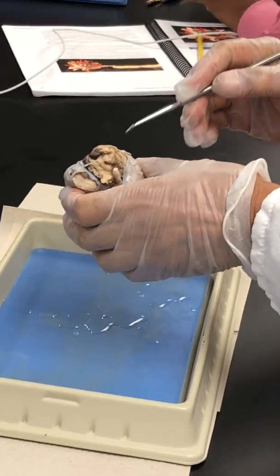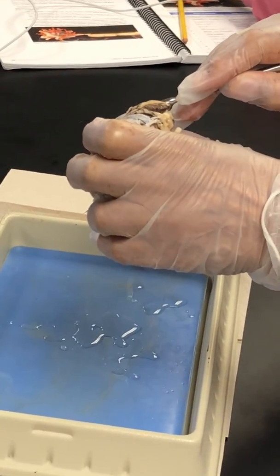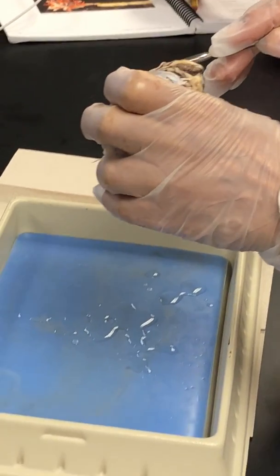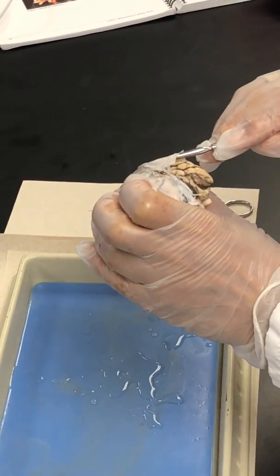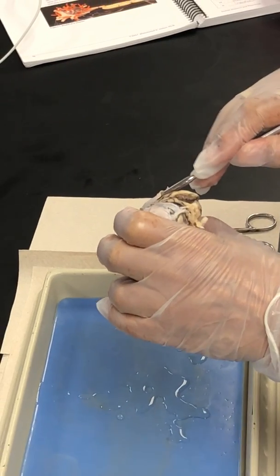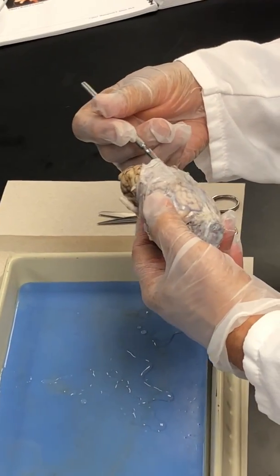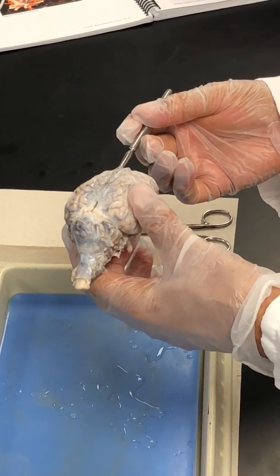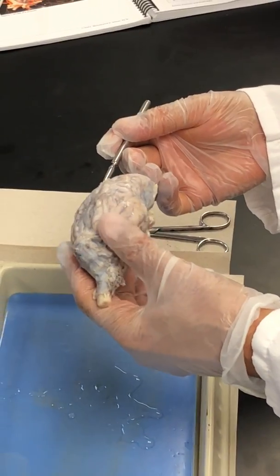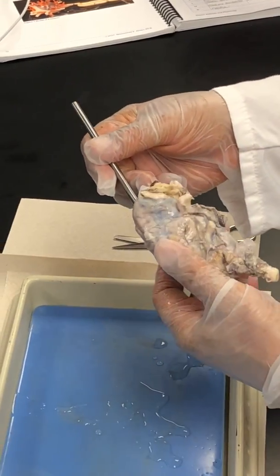One, you're going to see two of them actually. This is one of them right in here. That's called the dura mater. What they call in common language tough mother, because it's a very, very strong layer. It's very fibrous, and that's why things are going to be a little bit more interesting, because I need to kind of cut and remove this before I show you everything else. But that's one of the membranes that you need to notice.